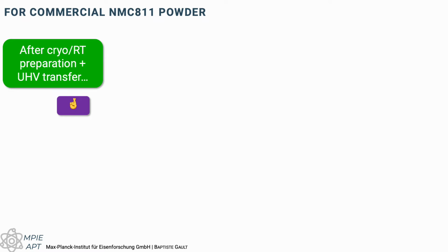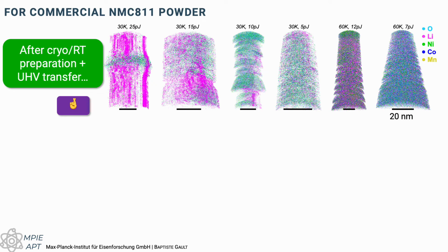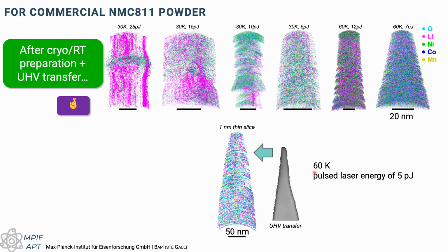We were very hopeful, and it did not work. We could see the same problems as before, where we had lithium coming out, basically field evaporating purely lithium for quite some time, and then sometimes a little bit of the material underneath. So this really was quite disappointing.